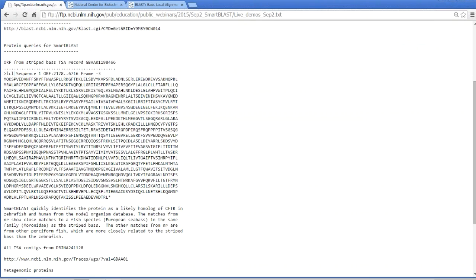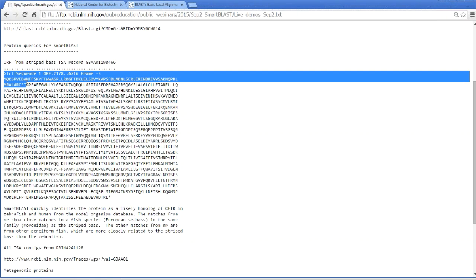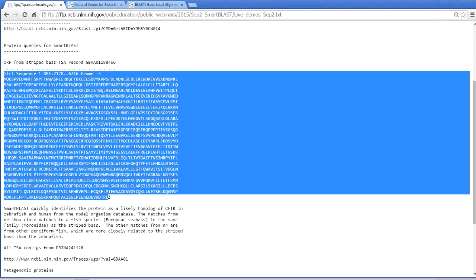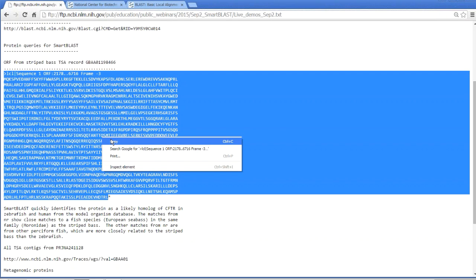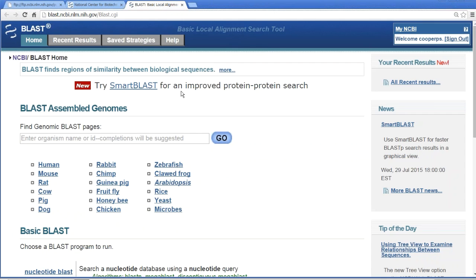It's from a vertebrate, so it's likely going to have lots of very close matches in the NR database. If I really just want a good name for this protein, I have a good chance of finding a homolog in human or zebrafish that would tell me something about what it is. I'm going to grab the whole sequence except for the asterisk representing the stop codon, copy that, go to the BLAST homepage, and click on SmartBLAST.